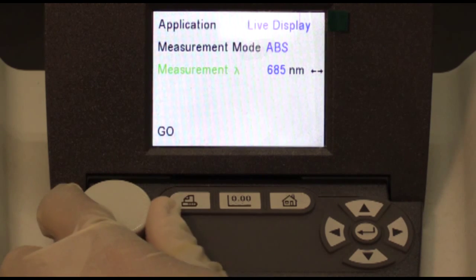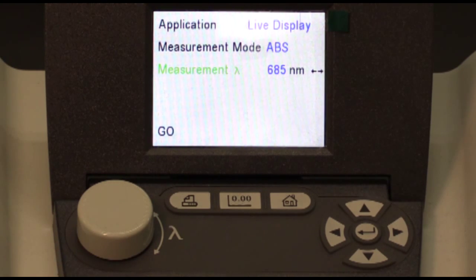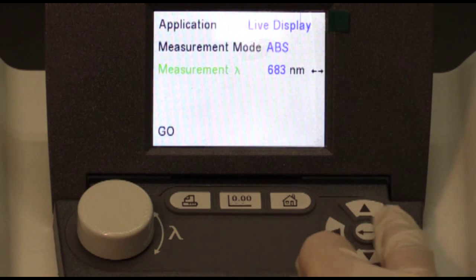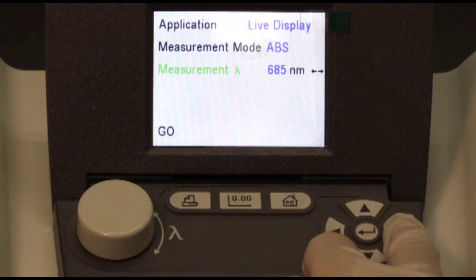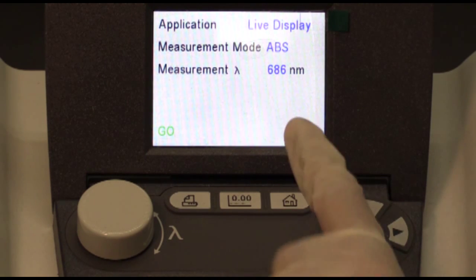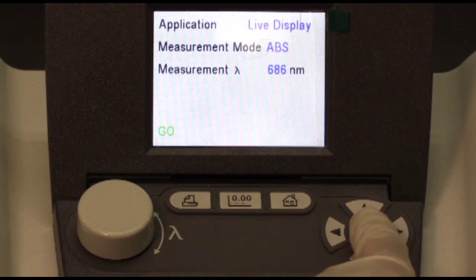The dial will adjust in 10 nanometer increments. For fine-tuning adjustment, use the left and right arrow keys. Once it's been set to the wavelength of interest, scroll down until the go is highlighted in green. To enter this wavelength, hit the enter button.